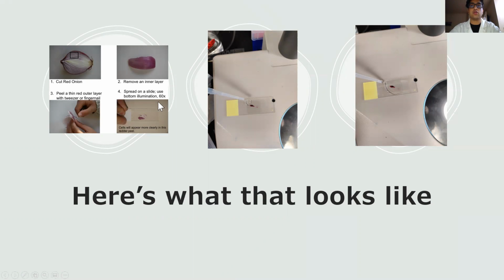And then you can use your microscope to look at it. And then here's what I was talking about, where you put the water onto the corner of the slide and the water kind of gets sucked in, as you can see in this third image here. Hopefully you saw my mouse hovering over that.